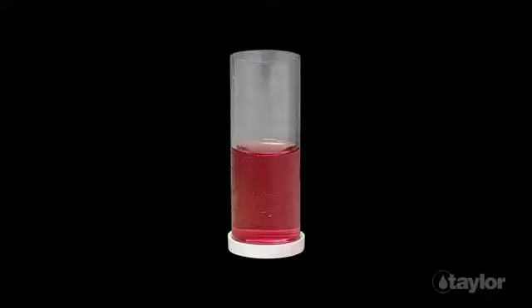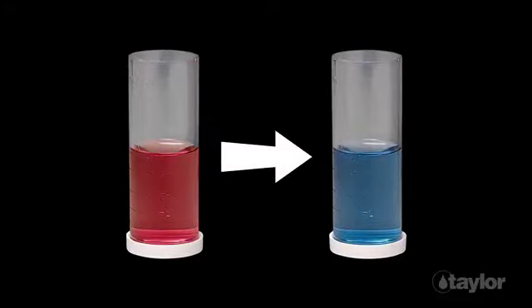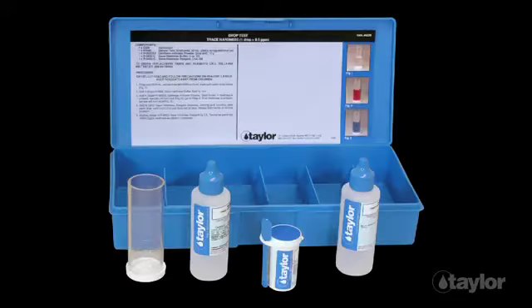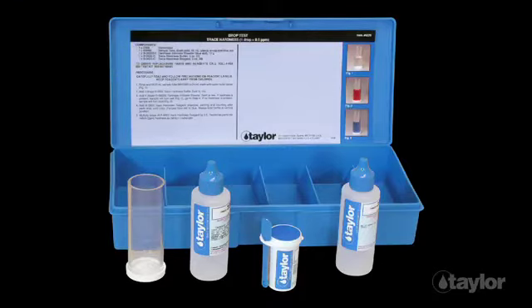Unlike other manufacturers' test kits that may produce a very subtle change of color at the endpoint, the distinct change from red to blue is easy to recognize using Taylor's K-1514. Note, if you are testing hardness levels below 5 parts per million, we recommend using our Trace Hardness Test Kit, K-1504, for improved accuracy.